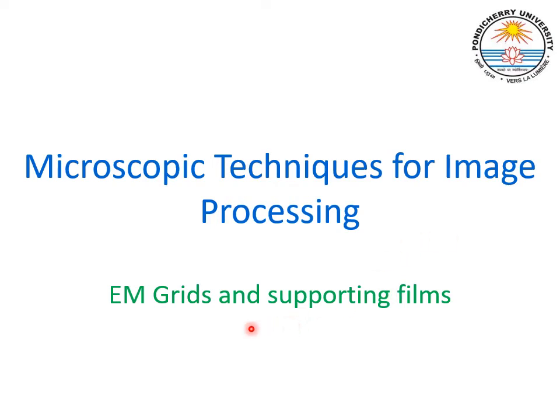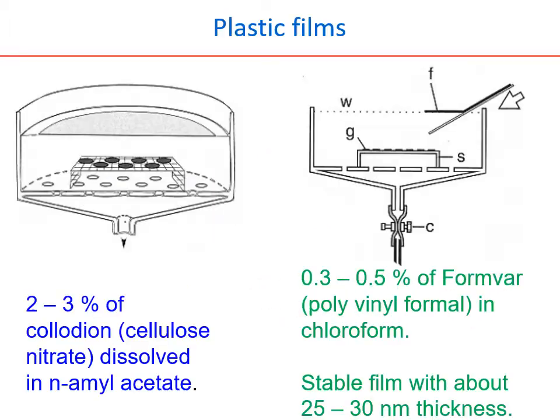Welcome back to the discussion continued on the EM grids and supporting films. So far we discussed the EM grids and supporting films, what the requirements of the materials are, and also what the types of the continuous films are. So here we discussed basically the two continuous films.